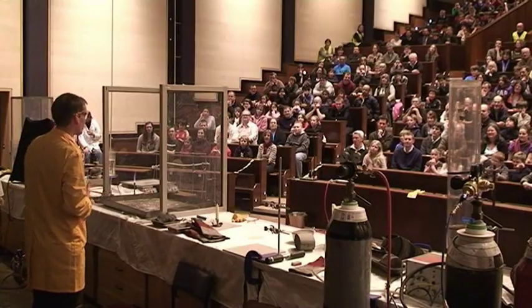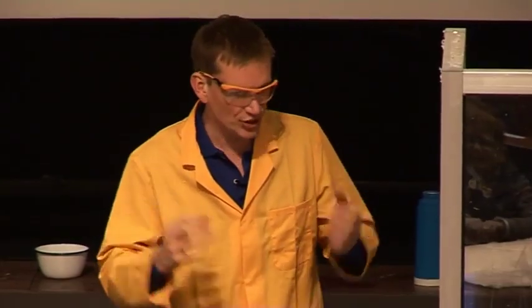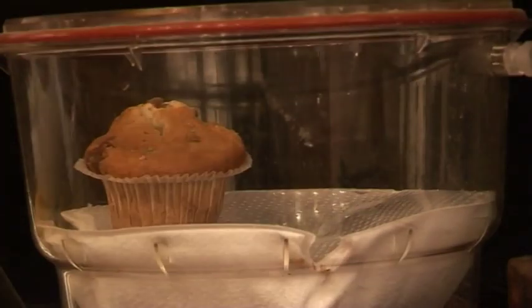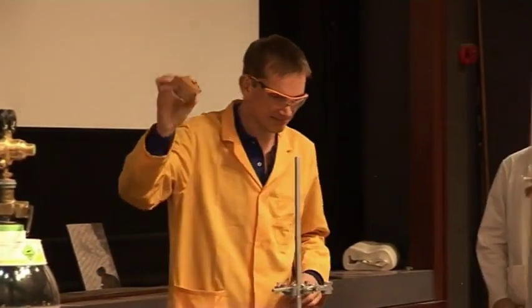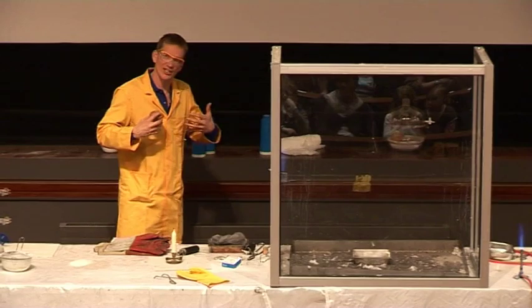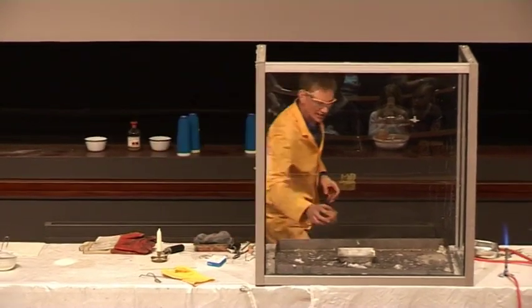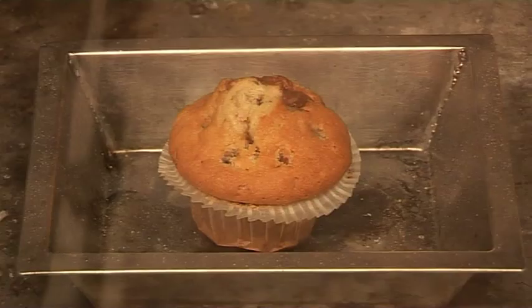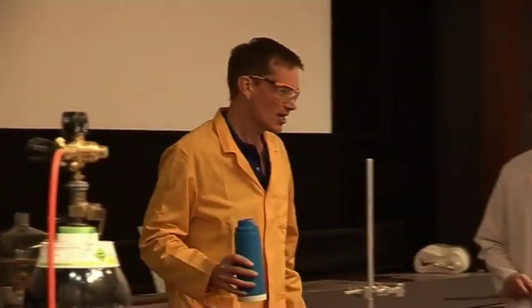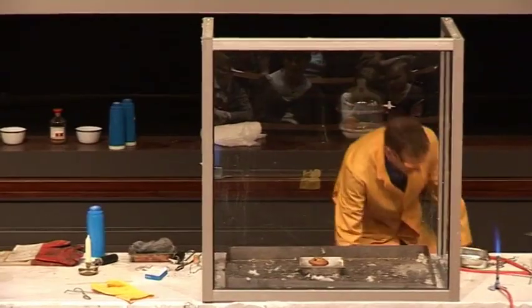Carbohydrates, such as the cotton and the wood, burn in oxygen, and it's the burning of carbohydrates that gives us our energy from our food. Now I have some carbohydrates here. This is a chocolate chip muffin. Not only does it contain carbohydrates from the flour and sugar, it also contains fats. All of these burn, and actually this is what gives us our energy. It's the reaction of the food with the oxygen that we breathe in. So I'm going to add some concentrated oxygen again. Actually, we'll have a little screen at the back here, I think.